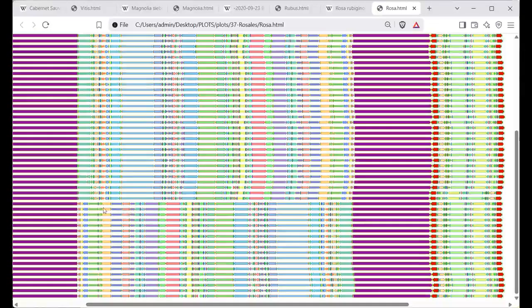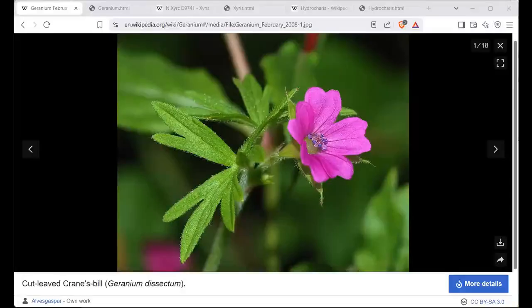And what I typically do is write another script to invert these ones so that they all have the same orientation. In the last four plots, you saw PGR-TK patterns for Vitis, Magnolia, Rosa, and Rubus, and they show the typical pattern. My students and I scanned through all of these various plots manually. First, my students looked into 4 orders, and then I checked all of the rest.